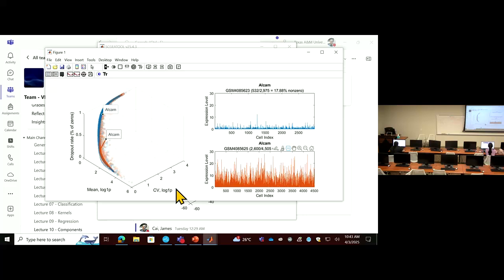Small state. And then you click through, you should have this picture. Batch ID.